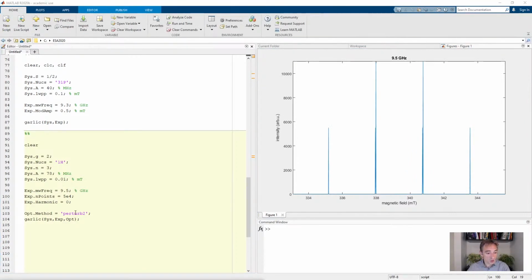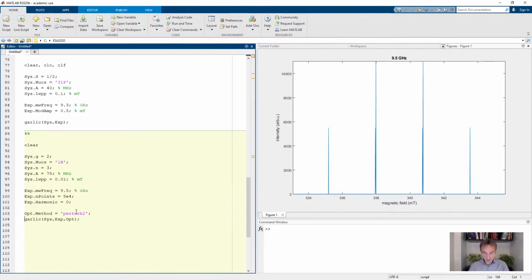So we can also plot the 2 things in parallel. So we can just call this spec1, and then we just copy paste this, and maybe just use the exact method and compare it to perturb1. The exact method, let's call it spec0, and just say plot B comma spec0, B comma spec1.